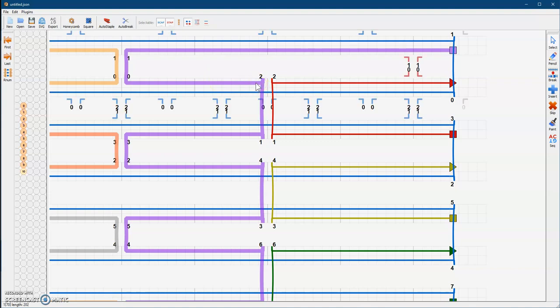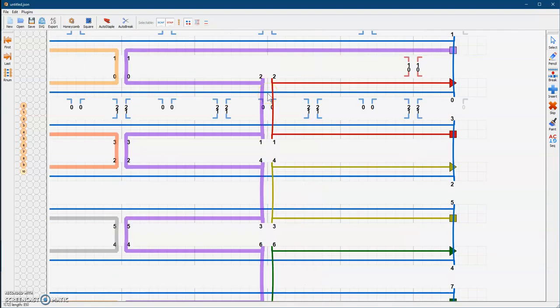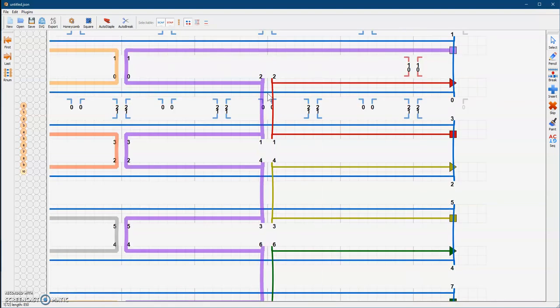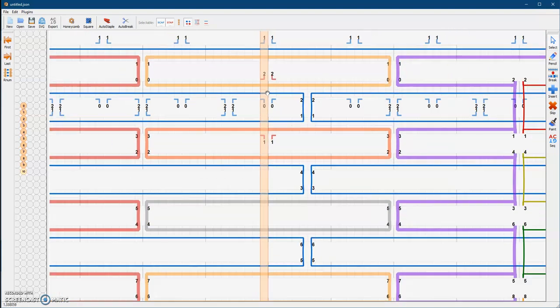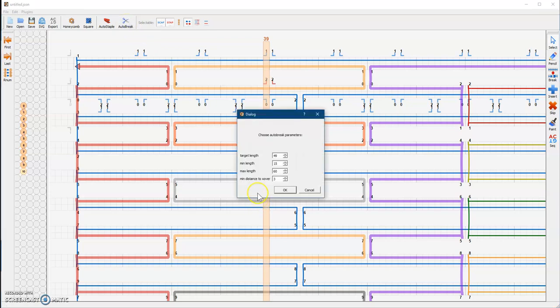These thicker lines mean that the strands are either too long or too short — it has to do with stability. So what we have to do is cut them down. We hit the break tool here, the scissors. It's going to ask you what target length you want. We usually want our max to be around 40, but let's go for 35 as our target length. That gives us good slack between our max and our min.